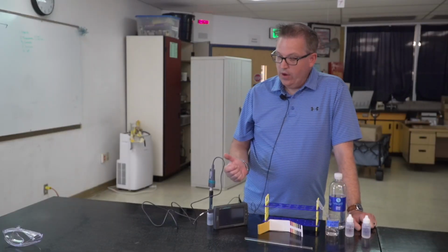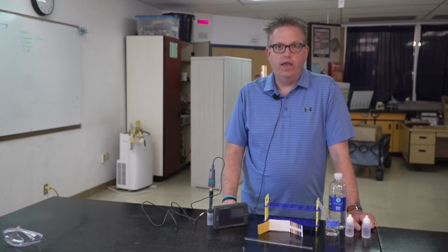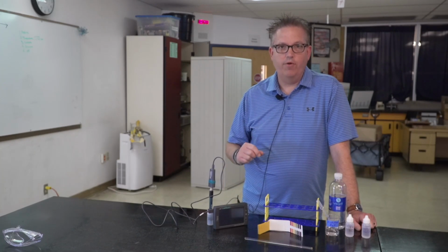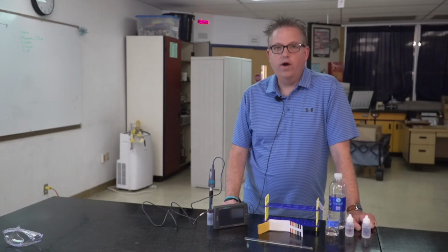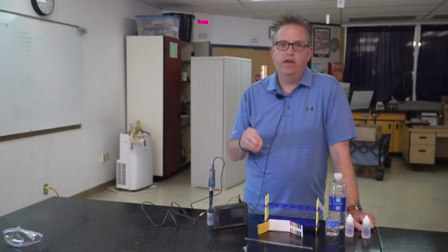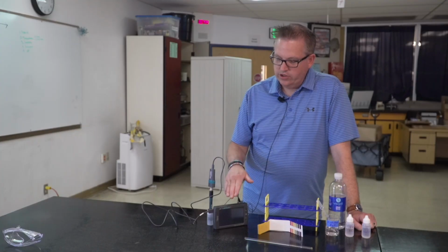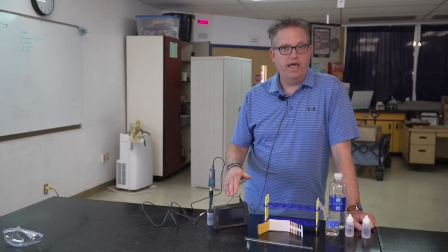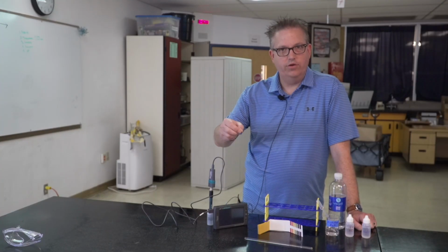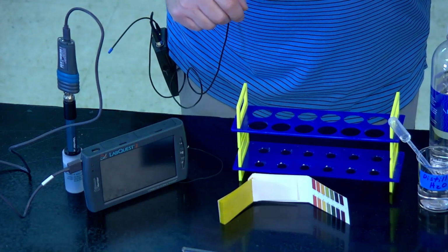And then when you actually get all of the solutions set up, before you run the experiment and start the timer of 4 minutes, you do want to go ahead and note on your data table what the pH is of each of those test tubes. And if you have a pH meter, a digital pH meter like this one, you can use that and actually just put the probe into the large test tube, and that will give you a digital reading on your display.